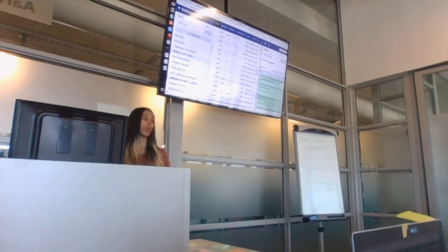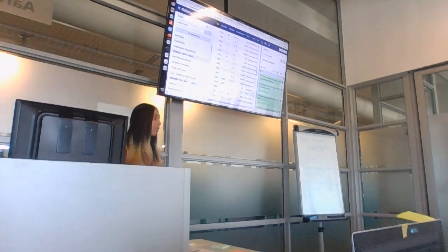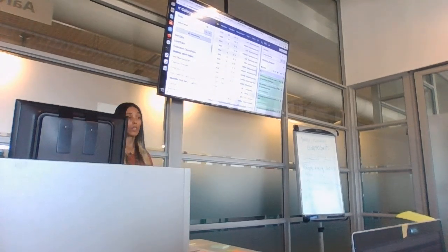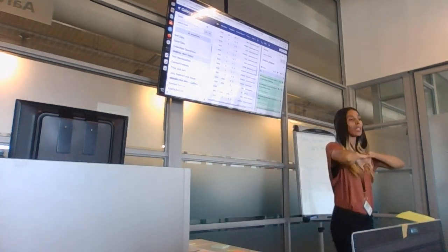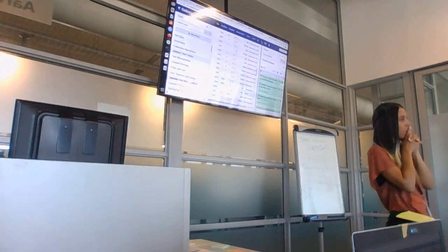Now, can you create a workflow out of that, please, and call it cholera workflow or something? No, not the Kraken one. The cholera dataset one. So, do you remember? Click around on the buttons and find how to create a workflow.